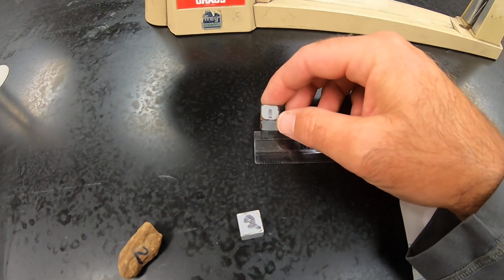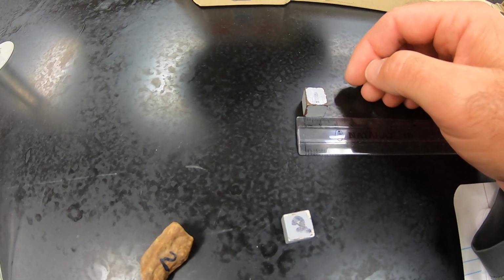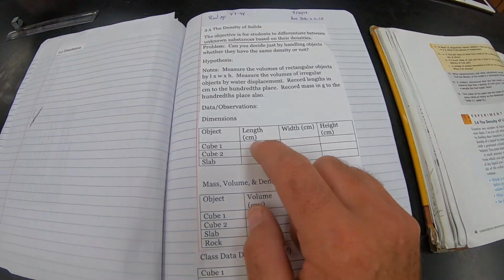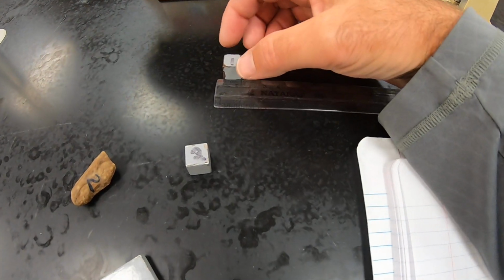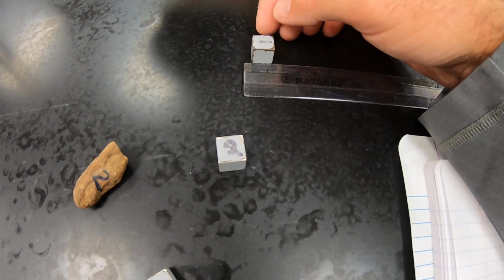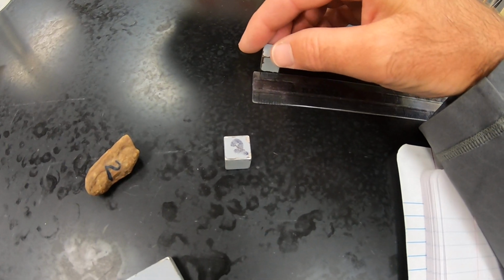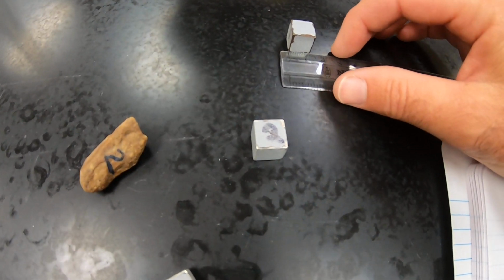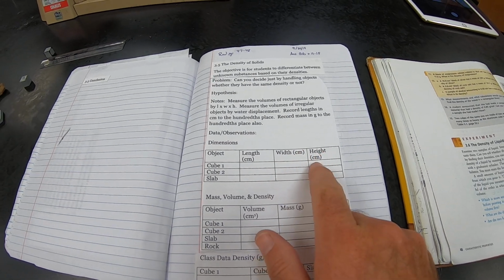So we'll start with cube 1. Since it's a cube, it should be the same on all sides, but we'll still measure it. It looks like it's almost exactly 1.2. So we'll say the length is 1.20. And then the width, I'm just going to turn it this way, is also 1.20. And the height, I'll turn it over here, is 1.20. So you should have 1.20, 1.20, 1.20.